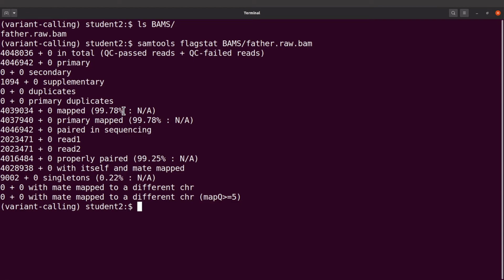So if, let's say, you are dealing with human genomes, you perform your read mapping and realize that quite a substantial number of the reads are not mapping to the reference sequence, then you should investigate further. That means probably something is wrong. It could be contamination, it could be sequencing error, etc. But you just need to make sure you check that as well. So that's about it.